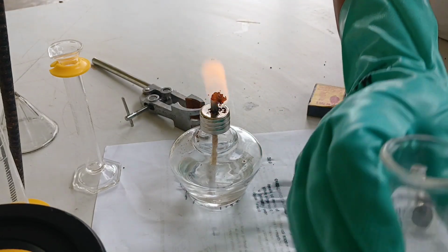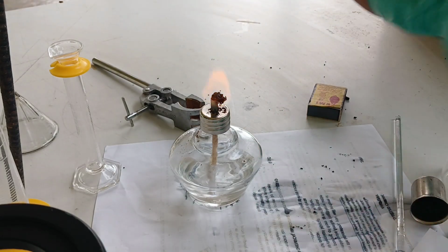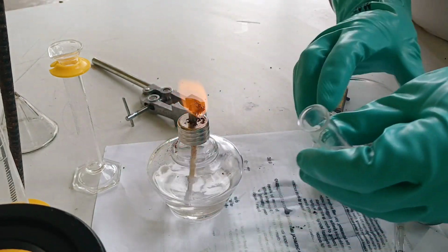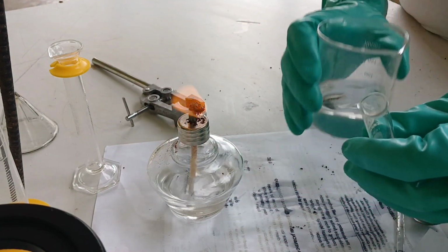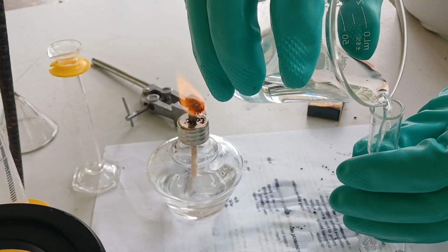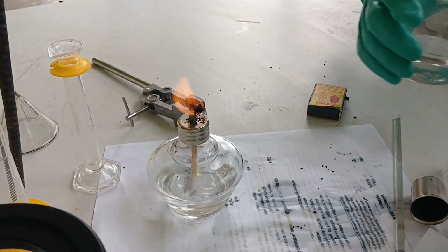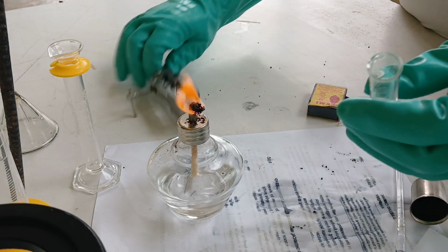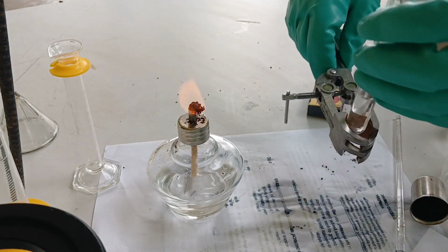This technique, safe heating of liquid in a test tube, is, of course, such that the liquid inside your test tube is your subject of interest, your sample. As you can see, I put a small amount in there, and I'm trying to let that sample react completely.